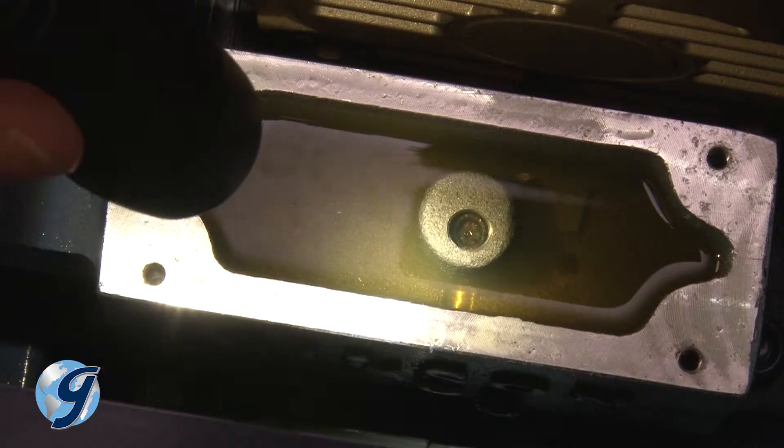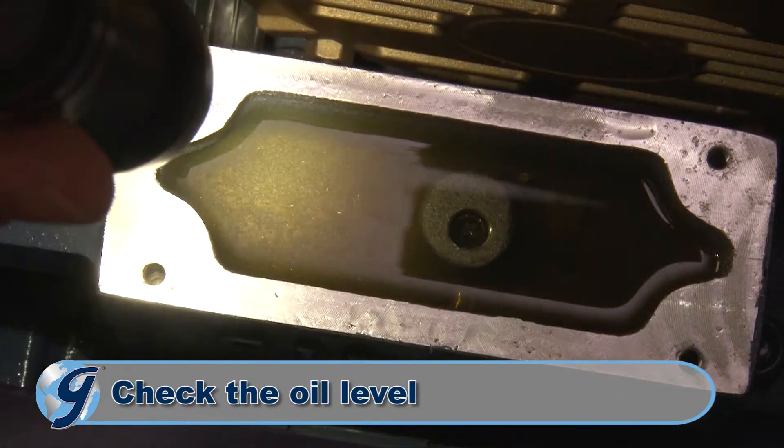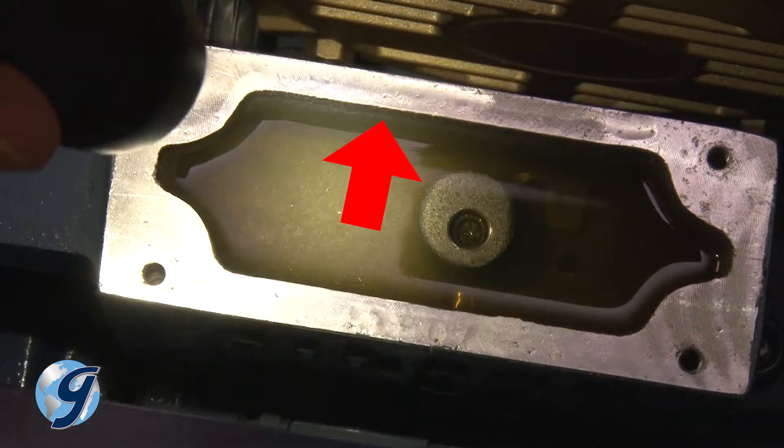Next, check the oil level in the pump. It should be a quarter inch from the top of the oil reservoir.